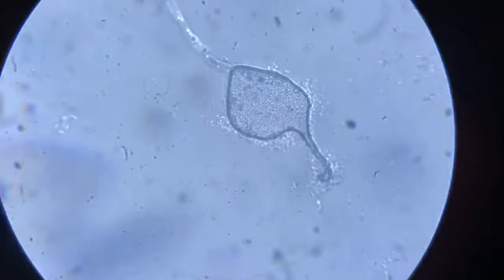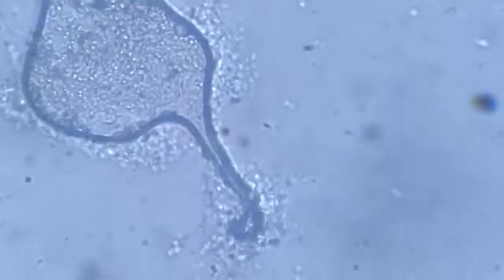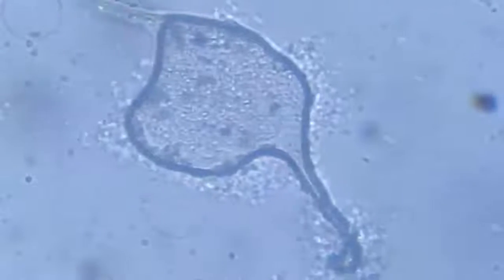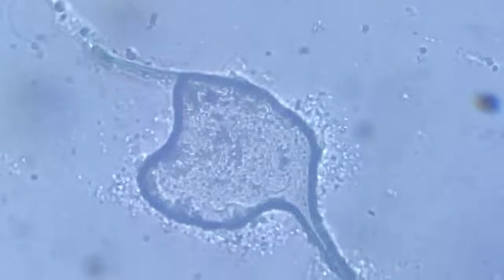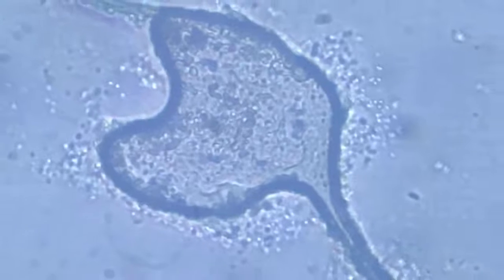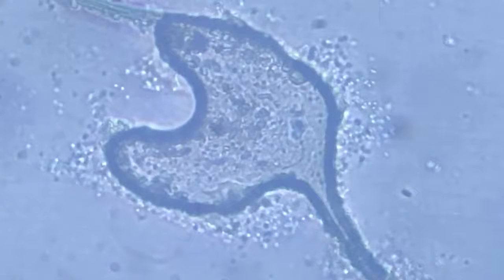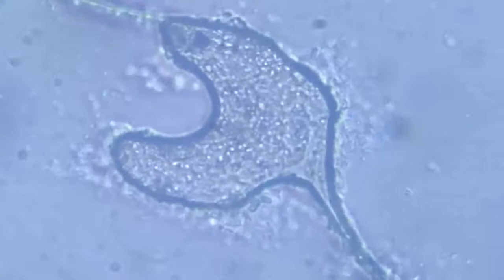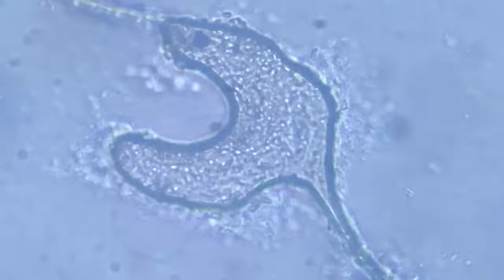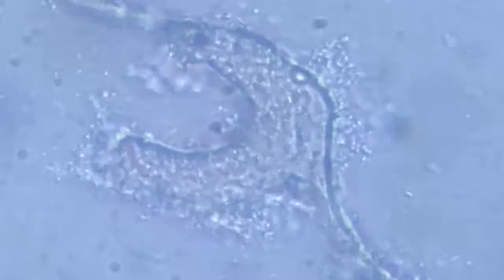All this water pocket contains is the protoplasm and still living, grossly living elements of two ciliates. There we also see those cell organelles which are being further imploded upon by the incursion of this water. And what remains out here is just those bacteria and the food remains, those food vacuoles which they had been consuming.